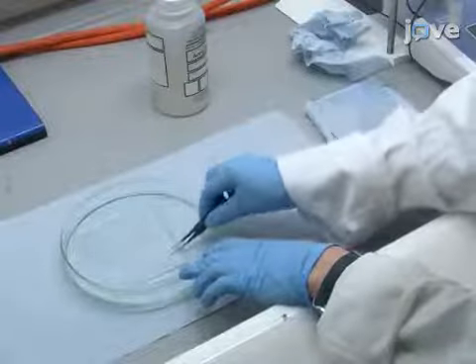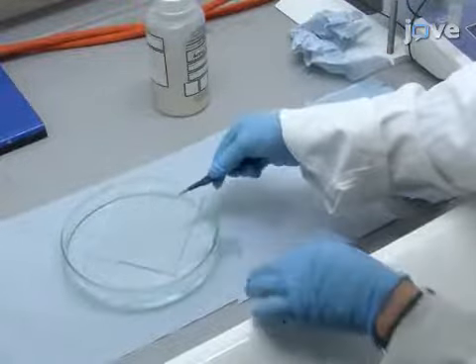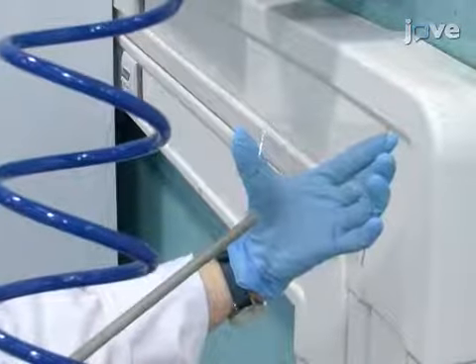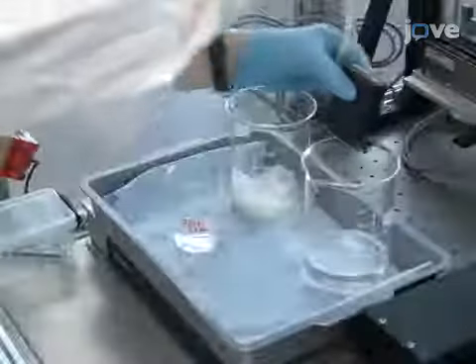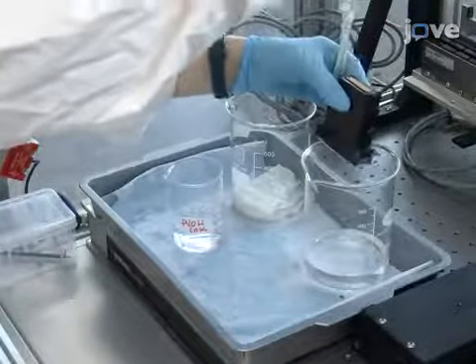Next, thoroughly clean the glass substrate first with acetone and then with deionized water. Using a nitrogen spray gun, dry the washed substrate. Load the substrate onto the print bed and secure it firmly. Flush ink through the print head to remove any air or cleaning solution from the reservoir and nozzles.